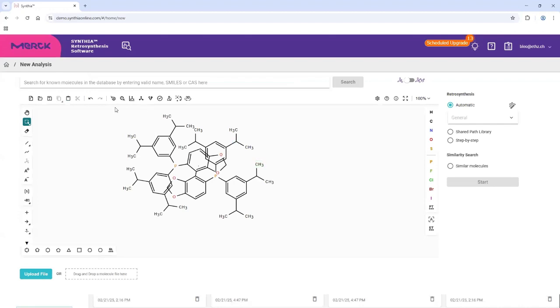And then you run this, and then that takes some time. So it could be for an easy molecule that within 10 minutes you have a result. Typically after half an hour, I would say it's finished, and you just start this, you can log out and it runs on this server. If you have a complex molecule, it can take several hours, especially if you specify, oh yeah, you want to have 10,000 iterations done, and that might be necessary if you have high complexity.